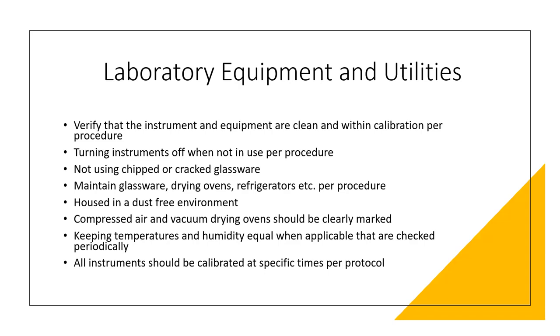So when you get into your labs, wherever they may be, there's going to be certain equipment that is validated or calibrated on a yearly basis, or on a 6 month or a quarterly basis. And there is equipment that has to be calibrated on a daily basis. That is something that you'll eventually just learn working in your laboratory. And this prepares the lab for optimal production.